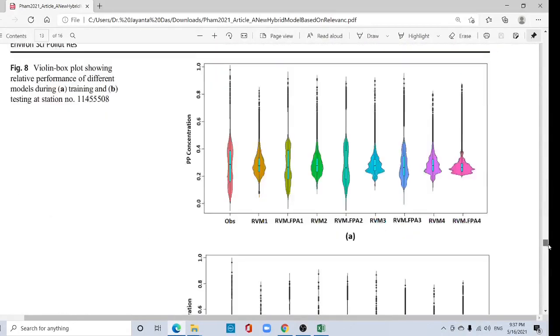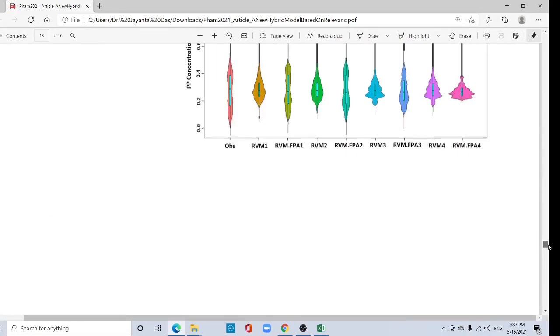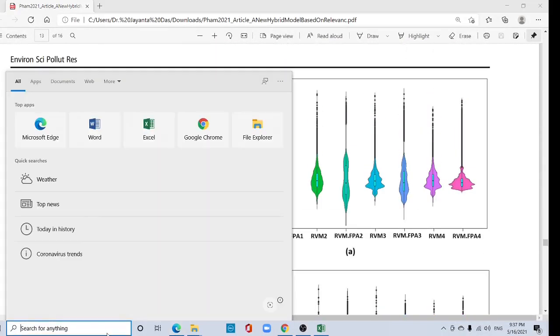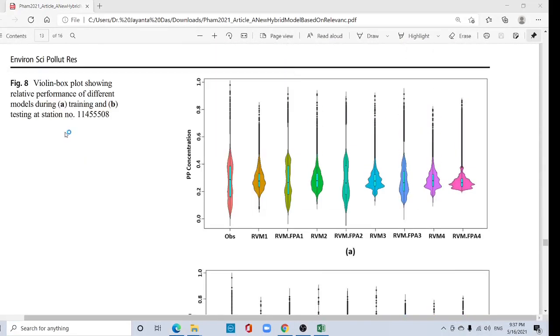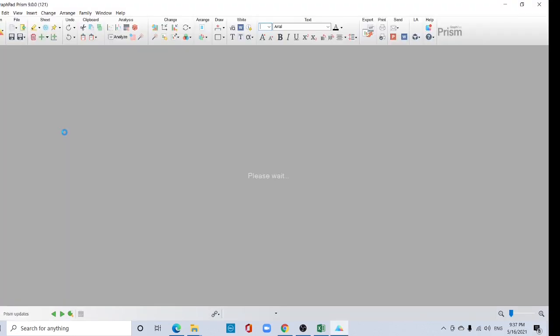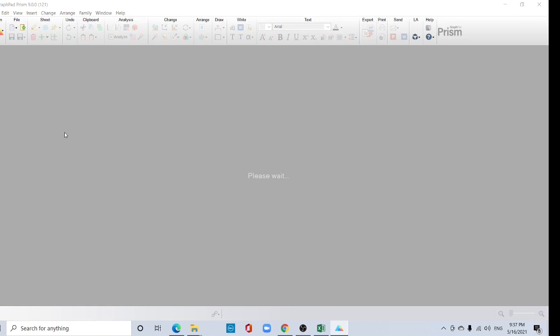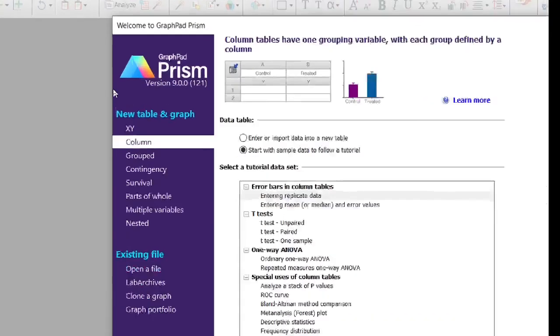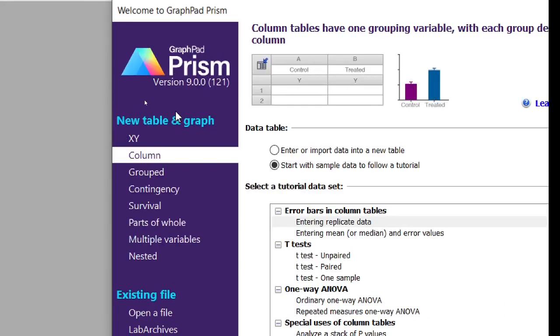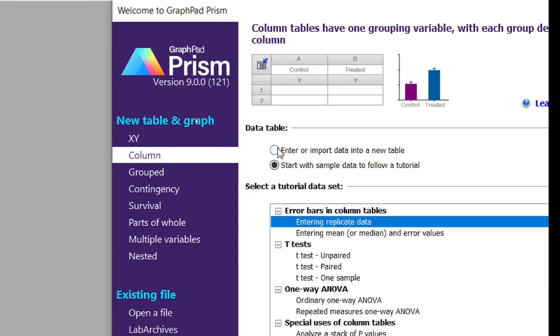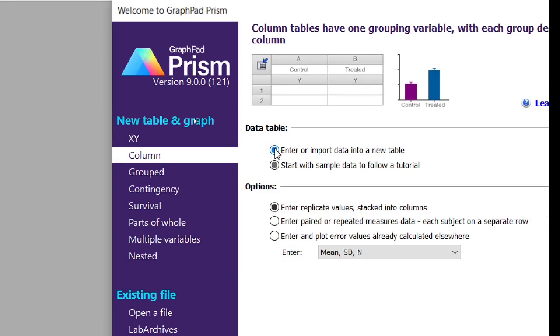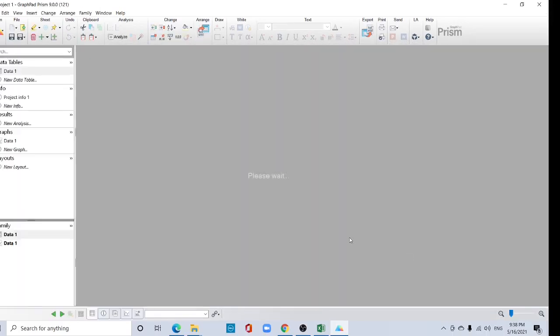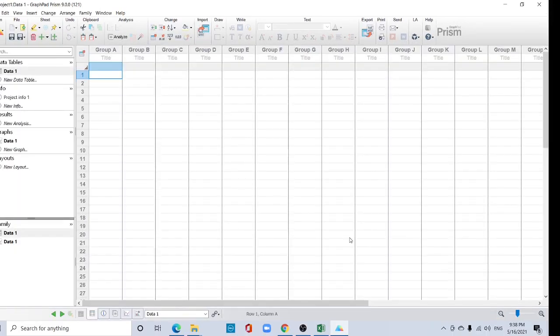Now, very easy way I will prepare this graph. Open your Prism. I am using GraphPad Prism 9. If you do not know how to install the crack version of Prism, go to my previous lecture. Now go to this column option, now click enter or import data into a new table, and you should click create. Okay, this interface will be open.